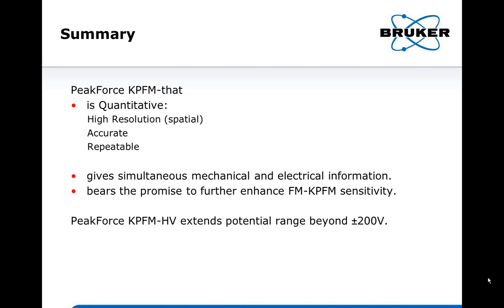I can only comment on the samples we have used, and typically it's doped. But we also imaged an SRAM sample. It has low doping all the way to high doping. It has P-type, N-type. The doping level, of course, will change the work function versus its intrinsic work function. But we haven't seen any problem detecting the potential or the work function difference across the range we have seen. It's really from 10 to 14 all the way to 10 to 20. We can see the difference.